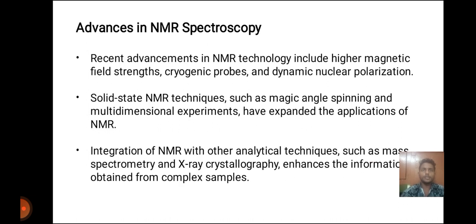Advances in NMR spectroscopy. Recent advancements in NMR technology include higher magnetic field strengths, cryogenic probes, and dynamic nuclear polarization. Solid state NMR techniques such as magic angle spinning and multidimensional experiments have expanded the applications of NMR. Integration of NMR with other analytical techniques such as mass spectrometry and X-ray crystallography enhances the information obtained from complex samples.